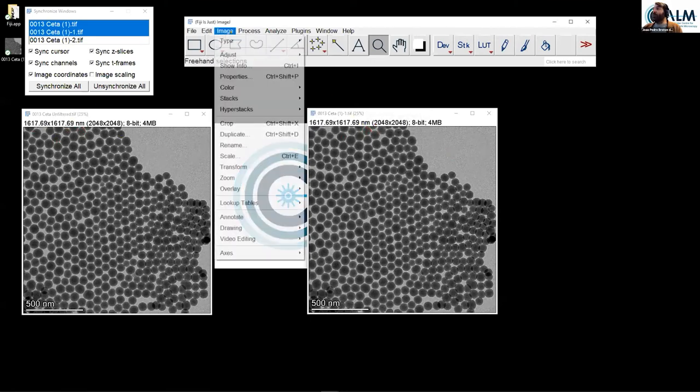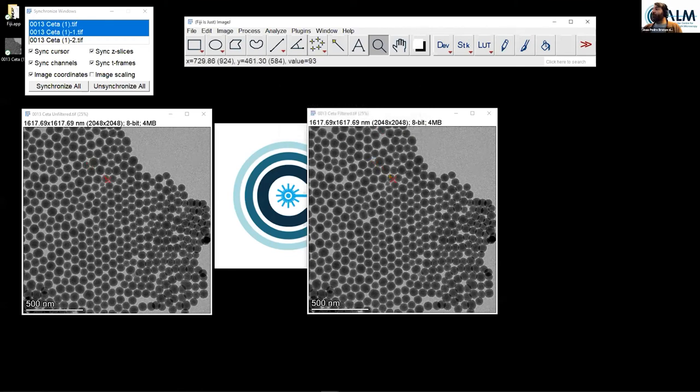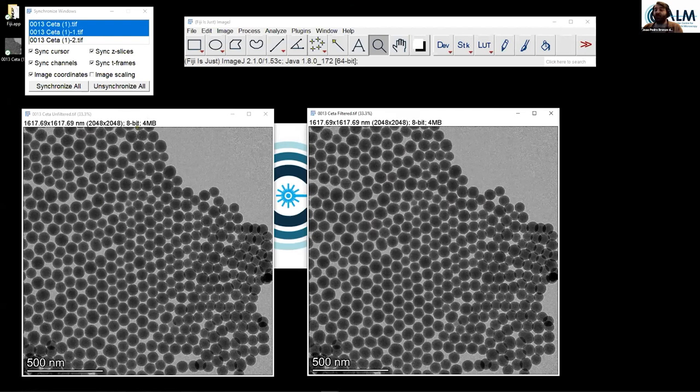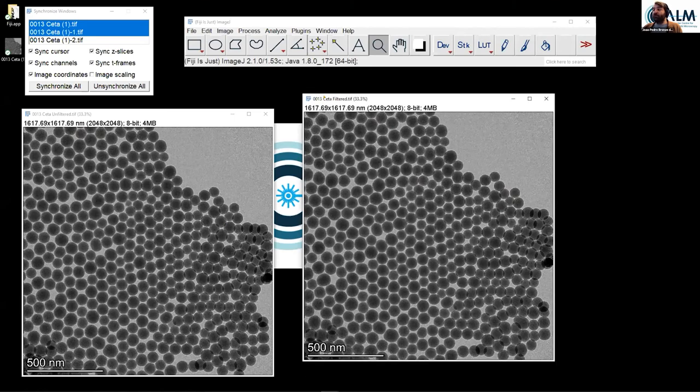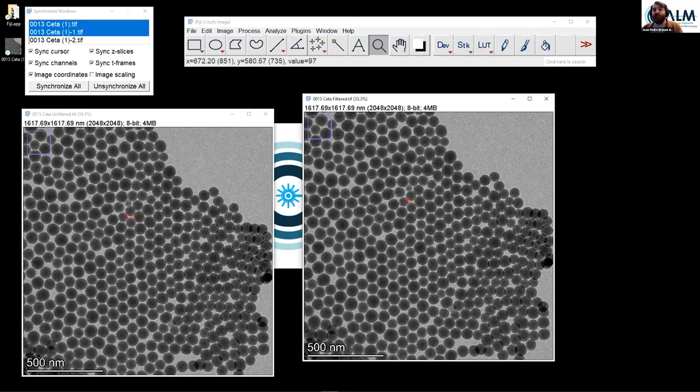And this will be my image, but this time I'll apply some modifications. This will be useful because it will show the importance of treating your image before actually processing it. So this will now be my filtered image. Okay, I'll just go back and make it a bit bigger so you can appreciate the image a bit better. Okay, so here's what I'm going to do. First things first, let's go through filters. What can we do to this image to make it less noisy? As you remember from Yarden's presentation at the beginning, we can apply filter kernels and convolve this image to get the desired effect.